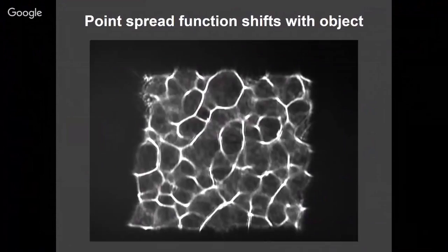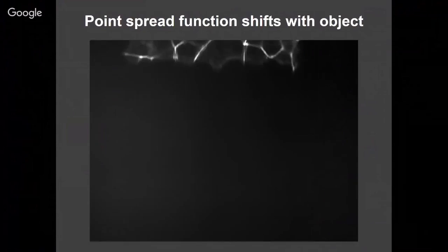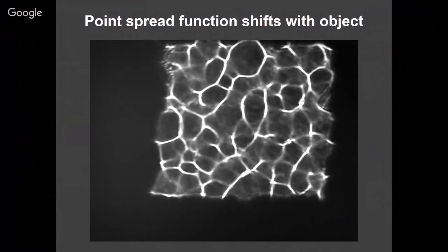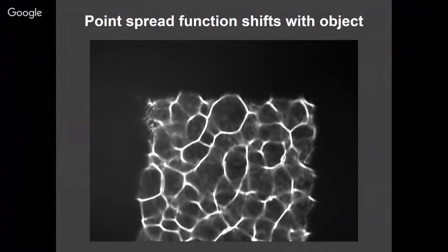So what I'm going to do now is to show a video. In this video, I just turned on the flashlight of my iPhone, and I'm waving it around. And what you see is this point spread function caustic pattern is shifting around, and it's shifting around in exact proportion to where my point source is in the scene. And so what we have is that because this diffuser is a thin phase mask in the caustic regime, which is why we designed it that way, it creates this point spread function that simply shifts with lateral position of the scene.